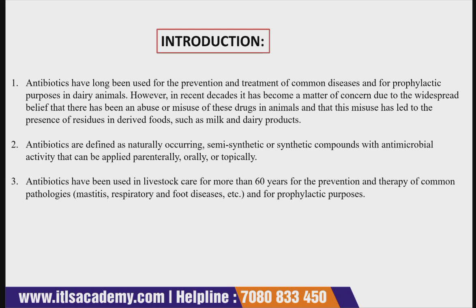So let's see the introduction part. Antibiotics have been used for the prevention and treatment of common diseases and for prophylactic purposes in dairy animals. However, in recent decades, it has become a matter of concern due to the widespread belief that there has been abuse or misuse of these drugs in animals, and that misuse has led to the presence of residue in derived food such as milk and dairy products.